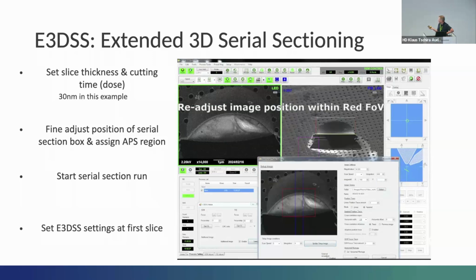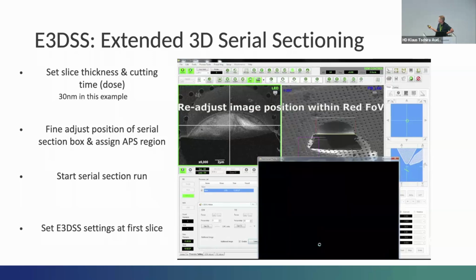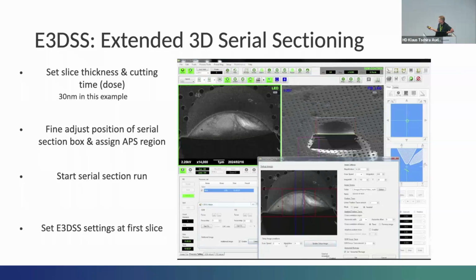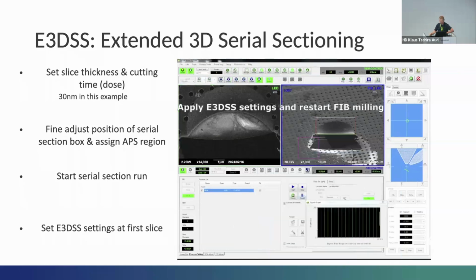Okay, they're setting up a number of image shifts. So up here, there's some additional controls. If you're not happy with the position of your cell, you can fine adjust it before you set up your final run. So the end user here wasn't entirely satisfied with where the cell was positioned, and was concerned about the area which was not being imaged being dosed unnecessarily. Now they've applied the montaging capability, so there's a one third overlap to make stitching easier, and then setting the system to acquire the volume. Let's skip on, okay.